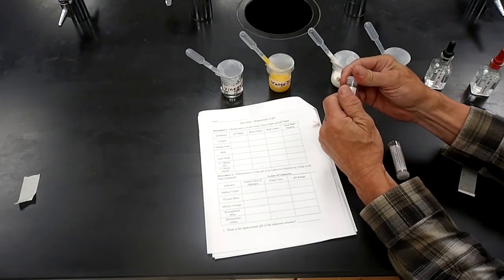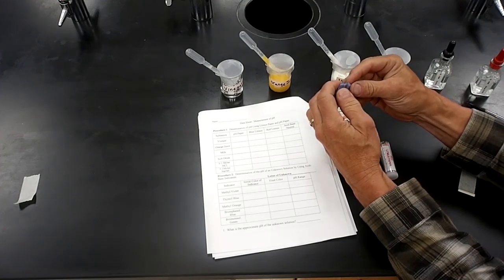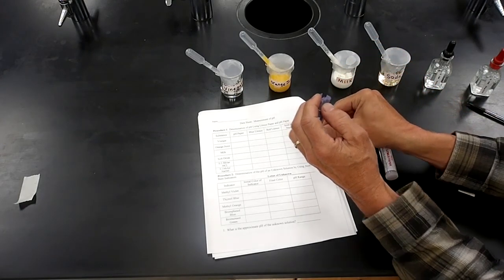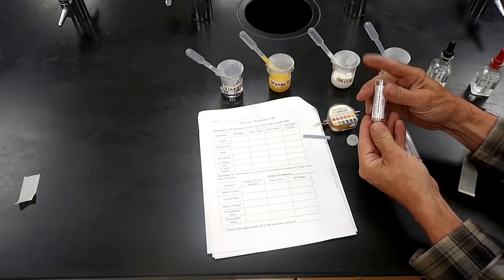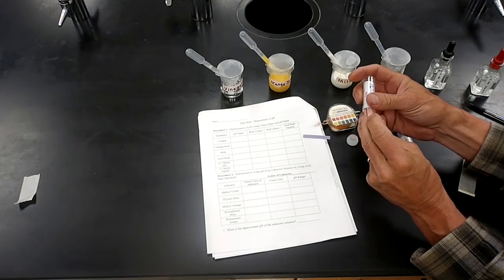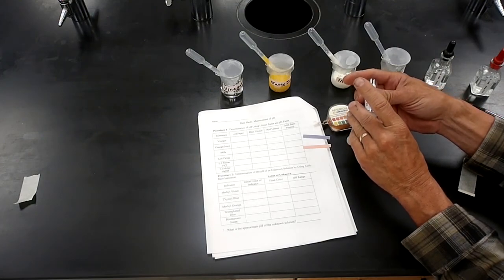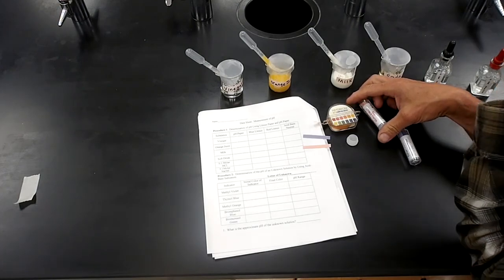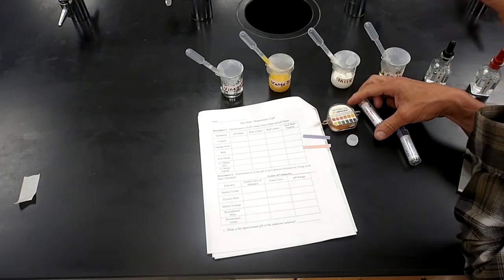The other thing we'll do is really crude. This is litmus paper. It's hardly used for anything anymore. This is really, really crude. What you've got are two types of litmus paper. You've got blue litmus paper, which surprisingly is blue, and you've got red litmus paper, which, as you might have guessed, is more or less reddish, pinkish. These simply change two colors. If the solution is acidic, it'll turn red or stay red. If it's basic, it'll stay blue or turn blue, and that's it. So all litmus paper tells you is it's an acid or it's a base.